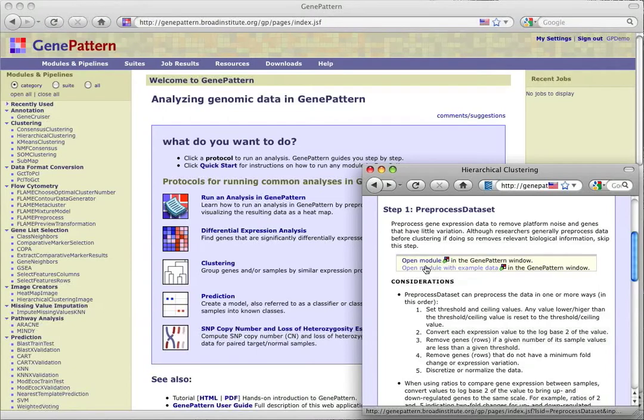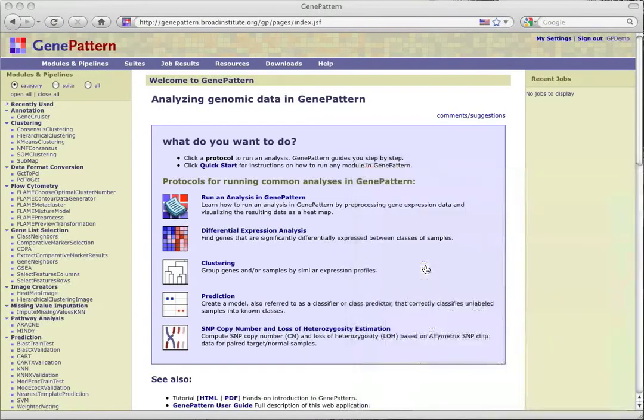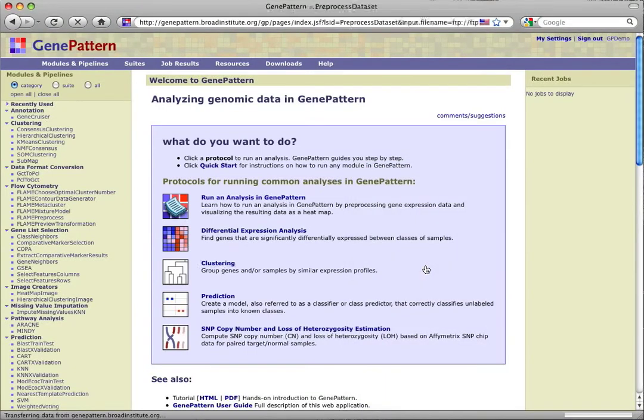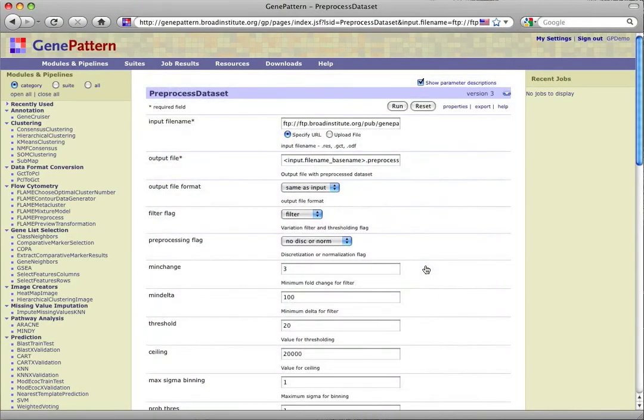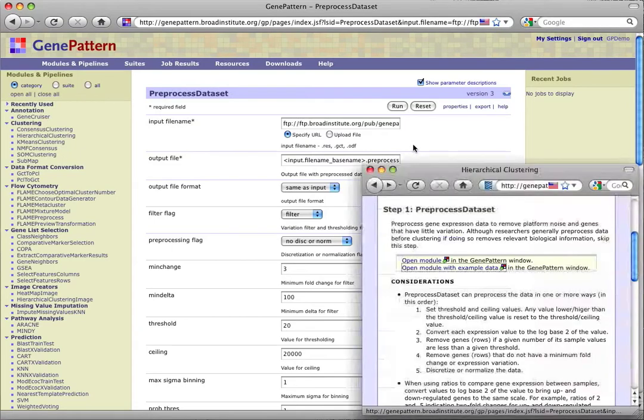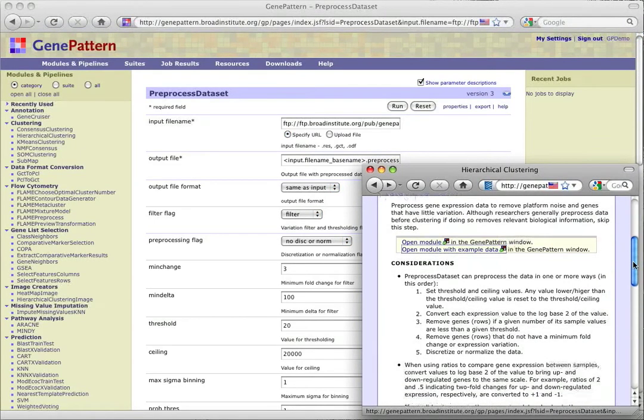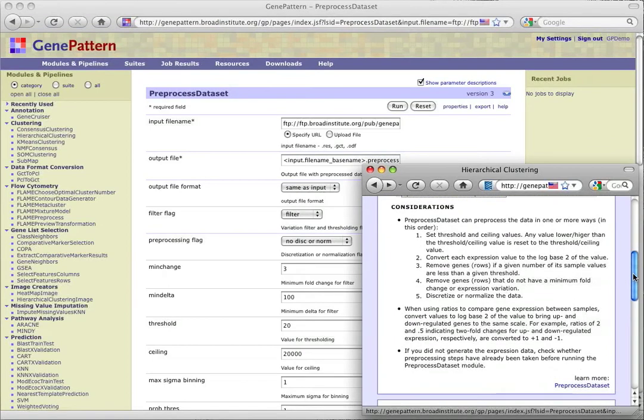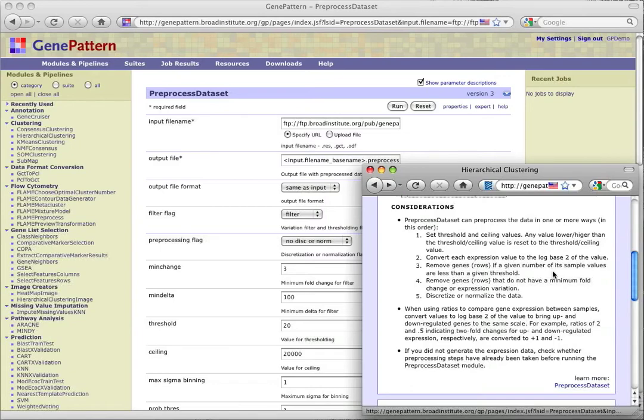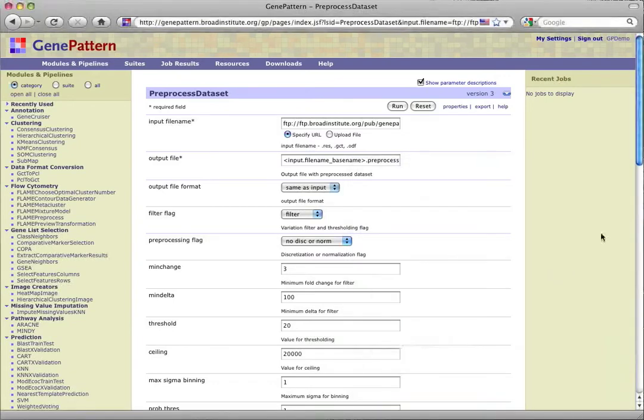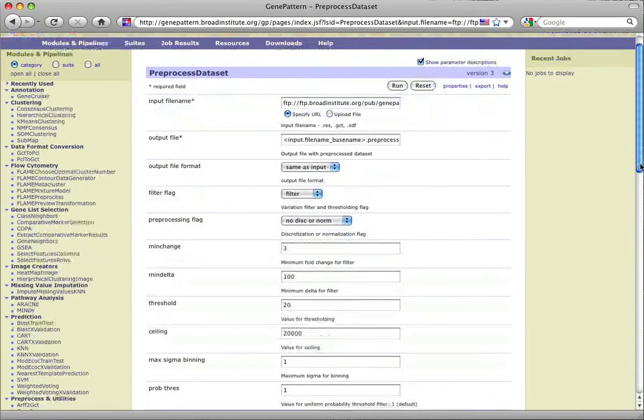Having chosen to open the module with example data, the original gene-pattern window is brought to the front with the module page for preprocessed data set displayed and the example file pre-populated as our input data. We can then look back at our protocol window to review the considerations and see if we want or need to alter any of the parameters from their default values. For this tutorial, we'll leave the parameters at their default values and run the module.